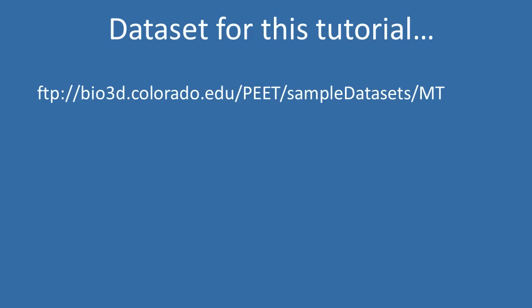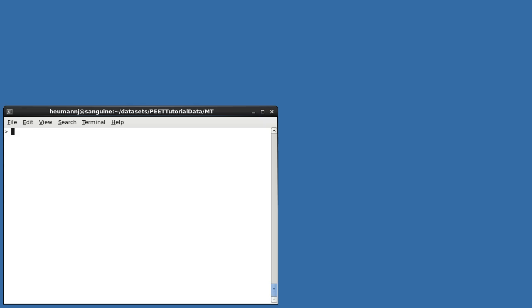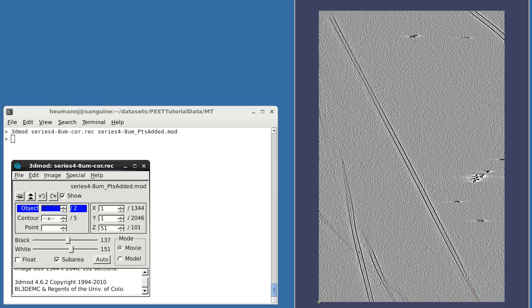The dataset and sample PEET projects used in this tutorial can be downloaded from the URL shown on your screen. If I open the sample dataset, you can see that the tomogram contains an almost straight microtubule running diagonally across the screen.